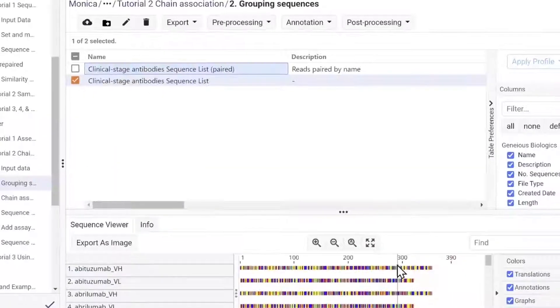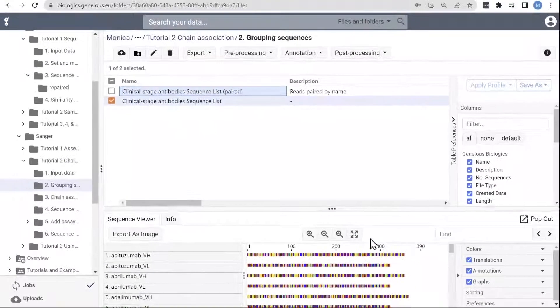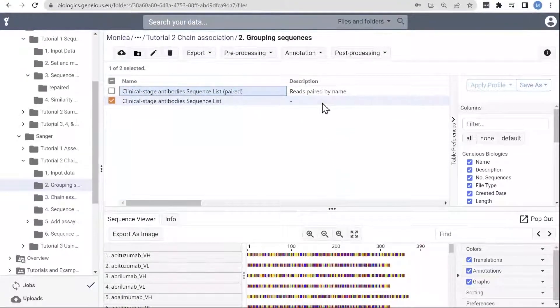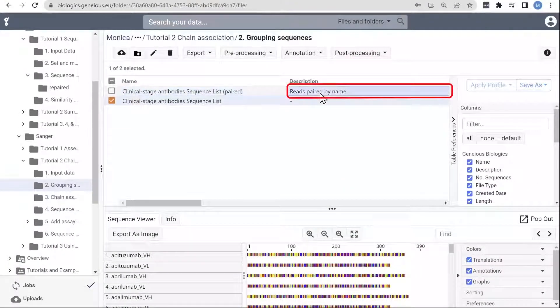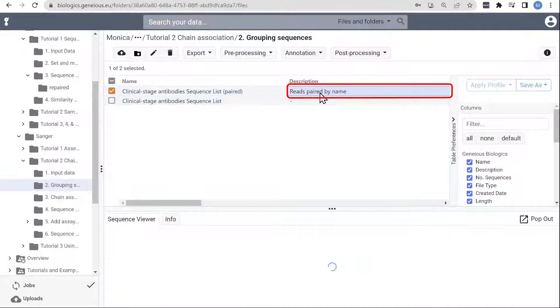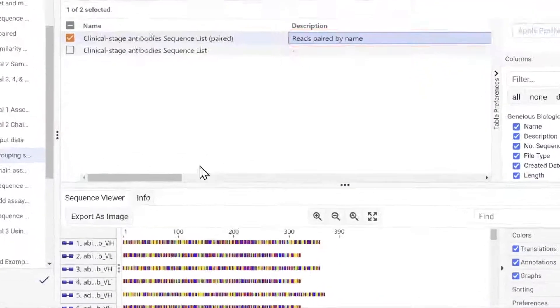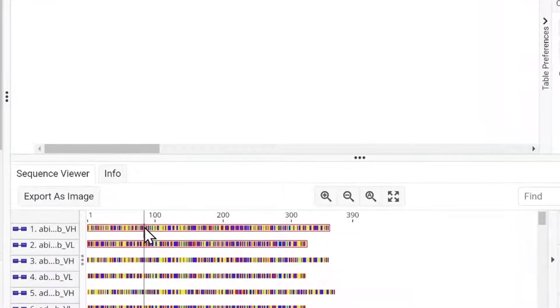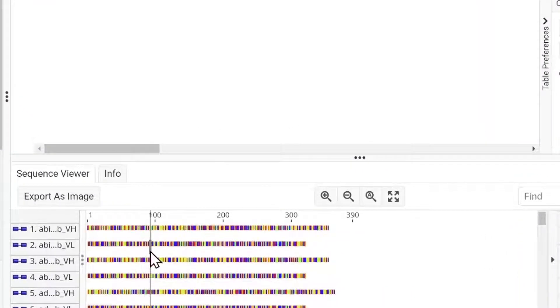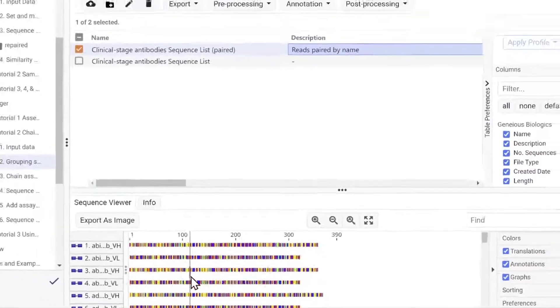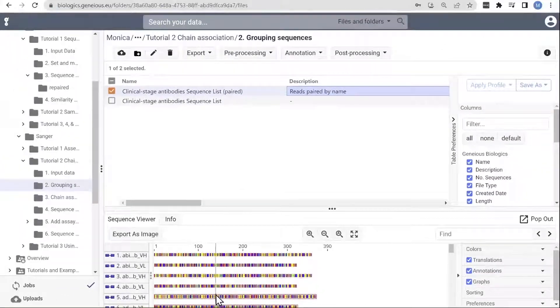Here are the results, indicated by the paired in the document title. You can see in the sequence viewer, if you hover over a sequence, it highlights the corresponding light or heavy chain that it's paired with.